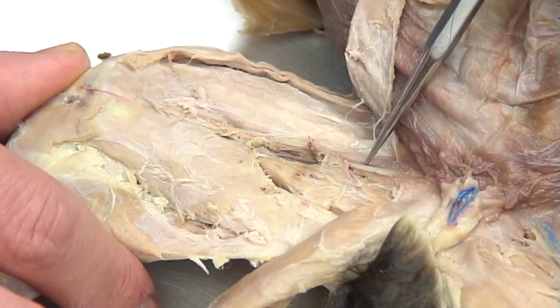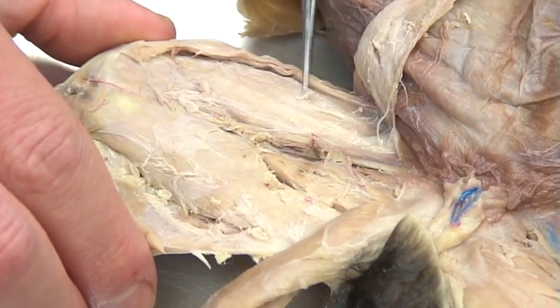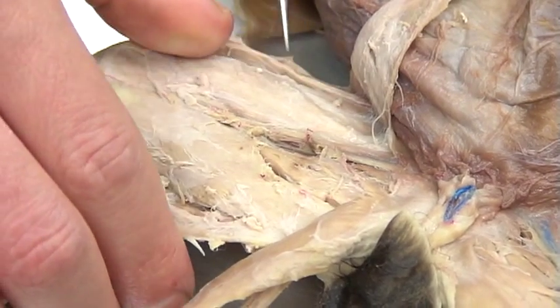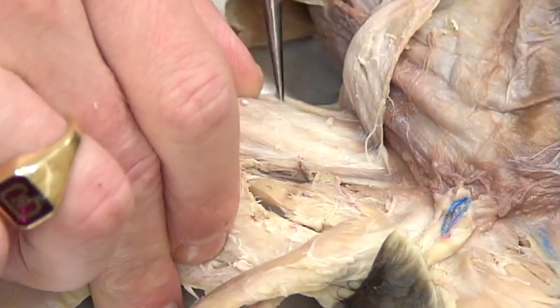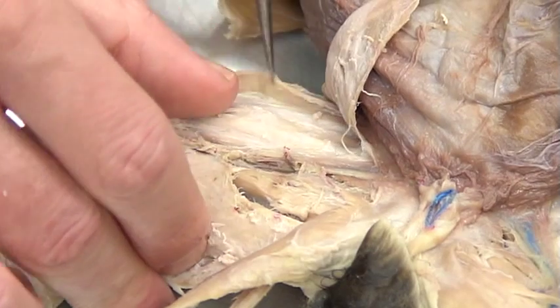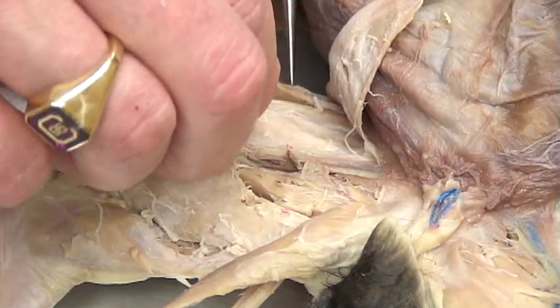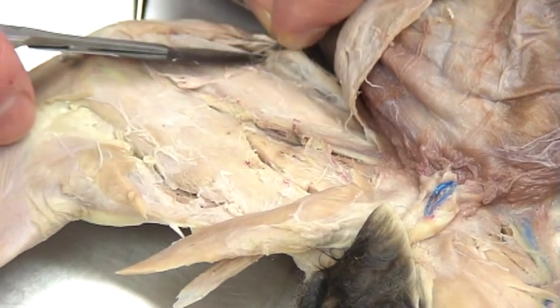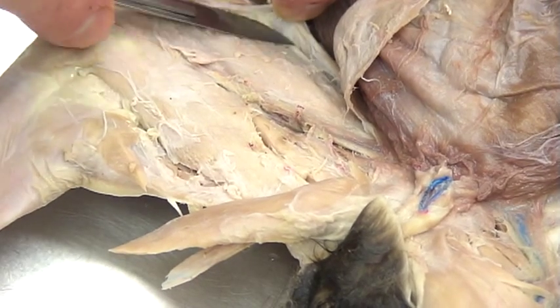Moving up to the top, above this blood vessel and underneath the reflected sartorius, you're going to see a couple of muscles. The first is going to be the vastus medialis. What I'm pulling away right now is actually the vastus lateralis — it's best seen from the other side but does wrap around to the medial side as well. There are actually several muscles underneath, which are our quadricep muscles, involved with extension of the lower leg.